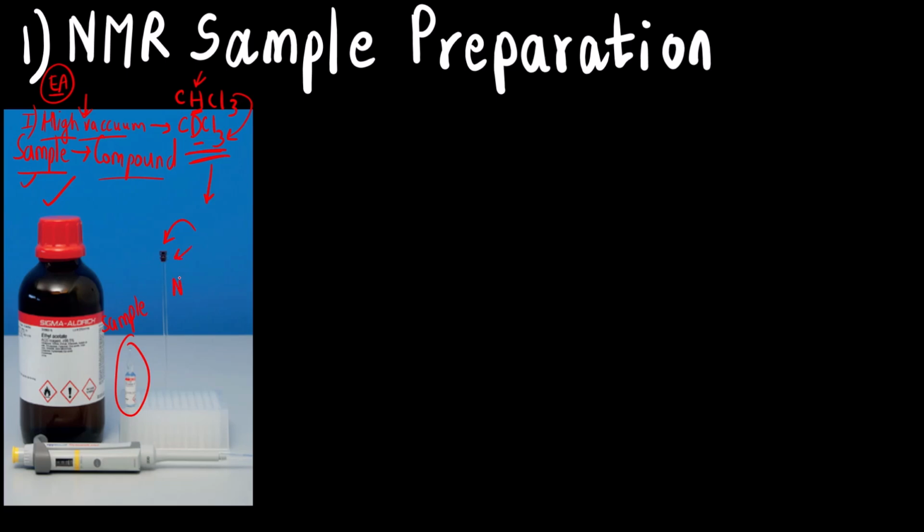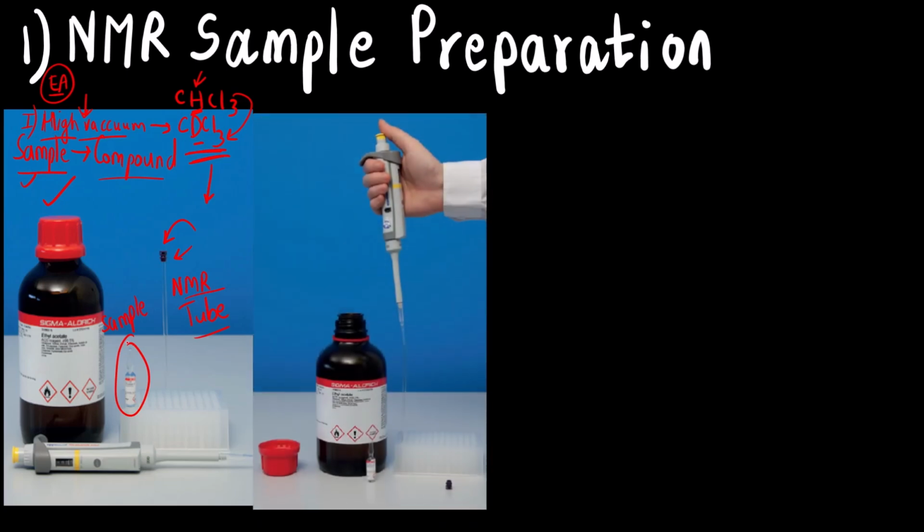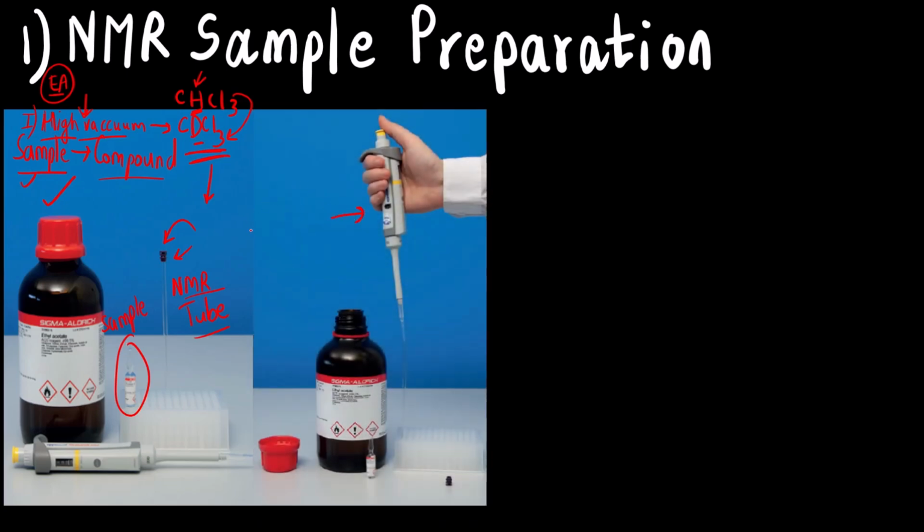This is called the NMR tube. Then how do you transfer the sample? Using this instrument, which is called the micro pipette. Its working is similar to a dropper, a glass dropper. How do you use a dropper?